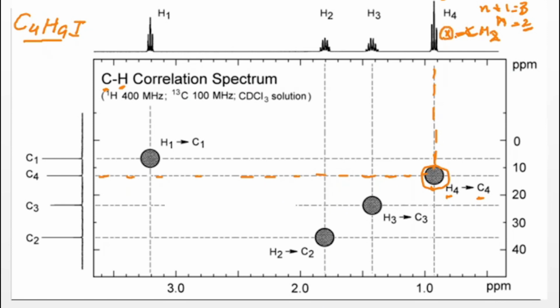I will say the carbon, and the decimal value is here, around 0.9.